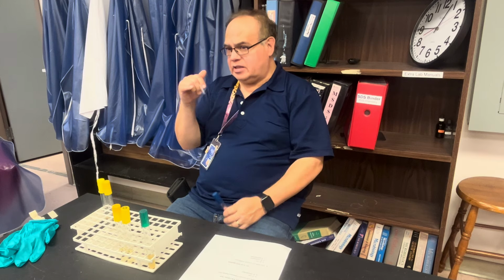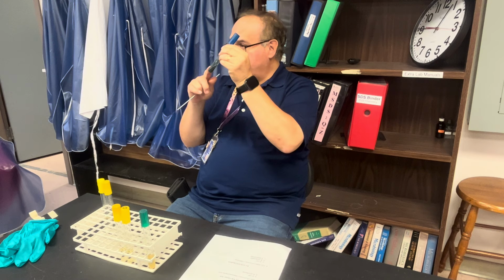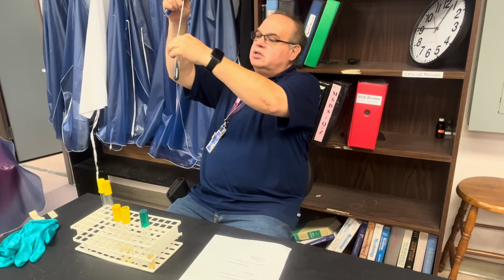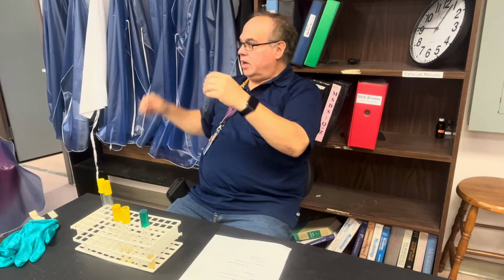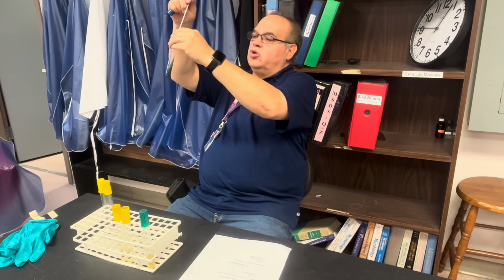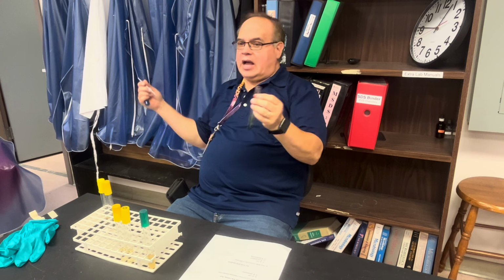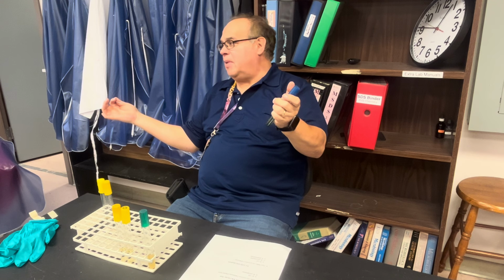The way you inoculate this, and any slant from now on that's differential or selective, is you're going to take the organism aseptically, take the needle and go in and then touch the bottom of the slant. You're going to streak the slant and then stab the butt. This is the butt. Okay? So once again, you're going to streak the slant and stab the butt. You can do this with a loop or a needle. We're not looking for any pattern. We're looking for the things that might be produced metabolically.